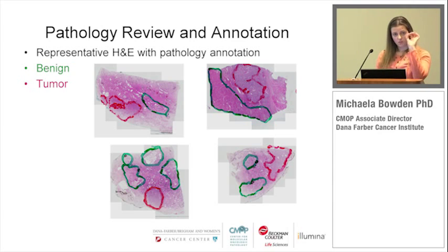And then within that, there's specific glands, which are tumor glands surrounded by a stroma and associated fibroblastic material. And so we go in and core in these areas, we triangulate the core to take them as close to each other as possible. A big thing with prostate cancer is it's very heterogeneous, so it's very hard to really precisely know that you're taking the same amount of material each time.